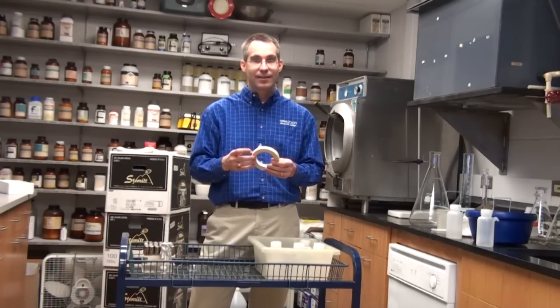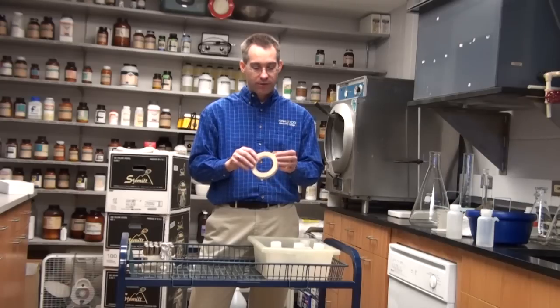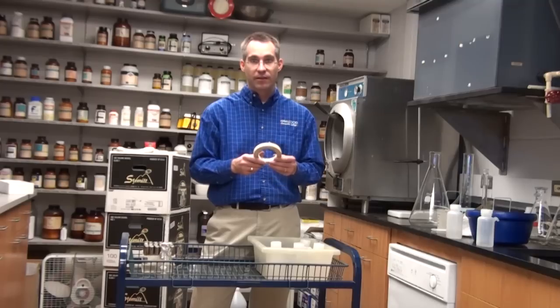Another important thing in the molecular biology lab is an indication that items have actually been brought up to temperature — that's where we use autoclave tape. In a food testing environment, you'll also see autoclave tape along with spore strips containing a heat-resistant spore or bacterium. If it grows after autoclaving, it shows the appropriate temperature and time were not reached. In a molecular biology lab, autoclave tape is usually good enough for media and creating sterile microcentrifuge tubes.